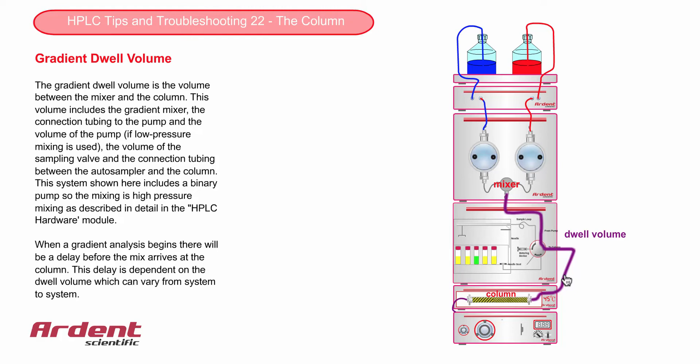One of the biggest reasons for poor reproducibility between HPLC systems is because of different dwell volumes. Even if the same column is used on a supposedly identical system, if the length and diameter of the lines is different, this can cause different selectivity, causing changes in resolution and even peak swapping from HPLC system to system.